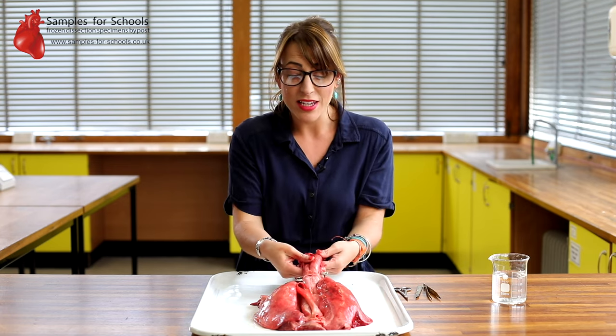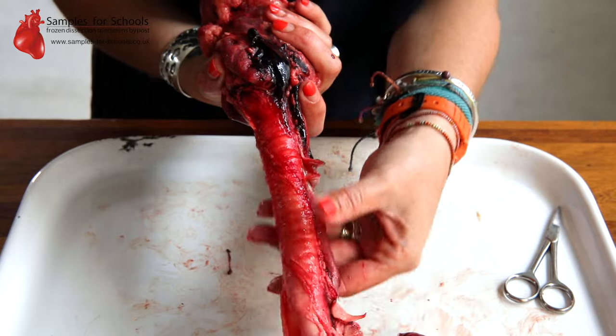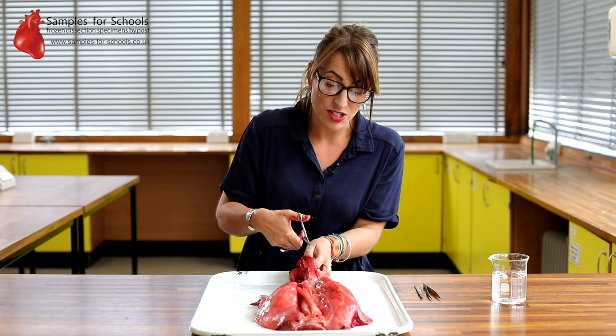Now, we need the trachea to stay open at all times. In order to do that, we have these rings of cartilage. In your sample, you're going to cut down the trachea to expose these cartilaginous rings.